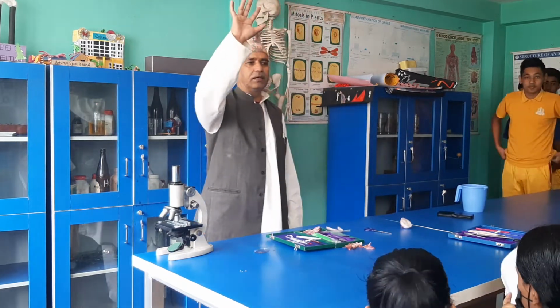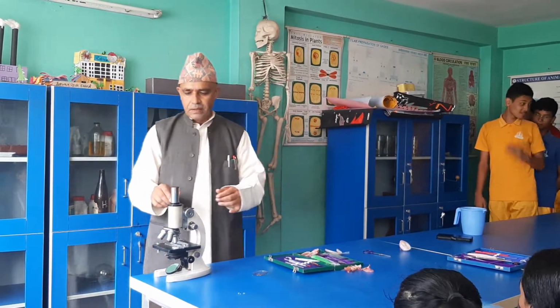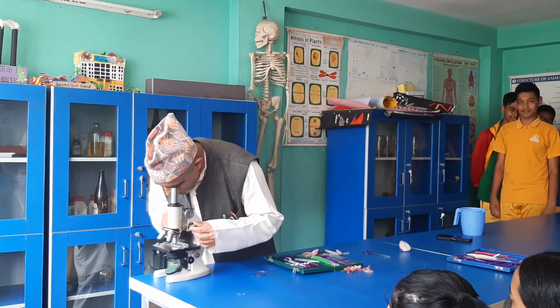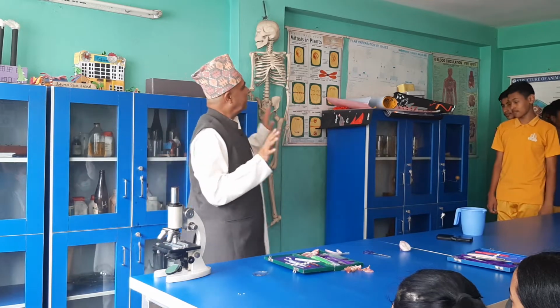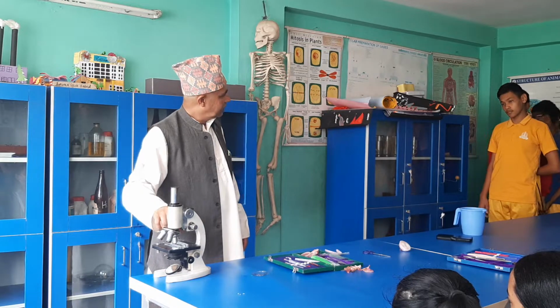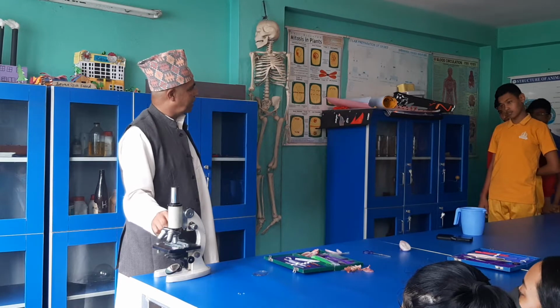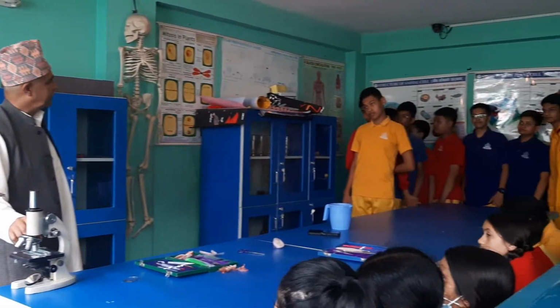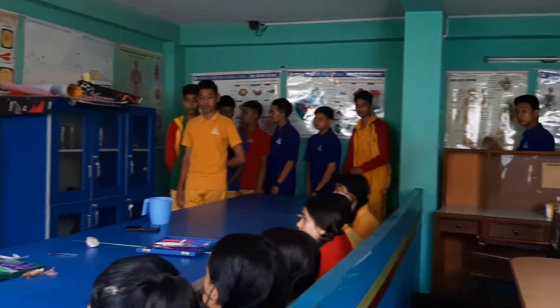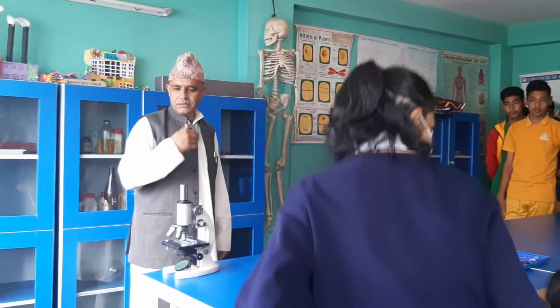Now everybody listen carefully. What to do? Just come here. After coming, you can just observe. What can you see? You can see some cells. Listen. Then you can move this one little bit left, little bit right. Can you hear? Yes. It moves the slide forward and backward. Then you can find out how it is. Okay? So shall we begin? Yes, sir. Once you go that side because there is a way to exit. So entry and exit. Please.